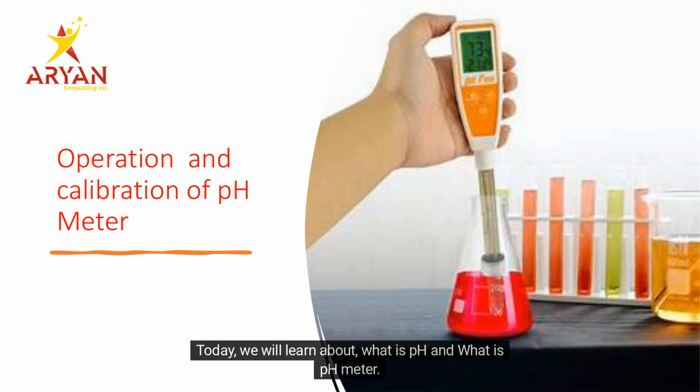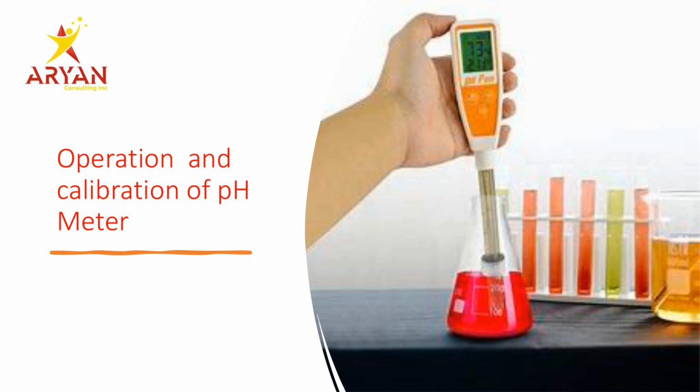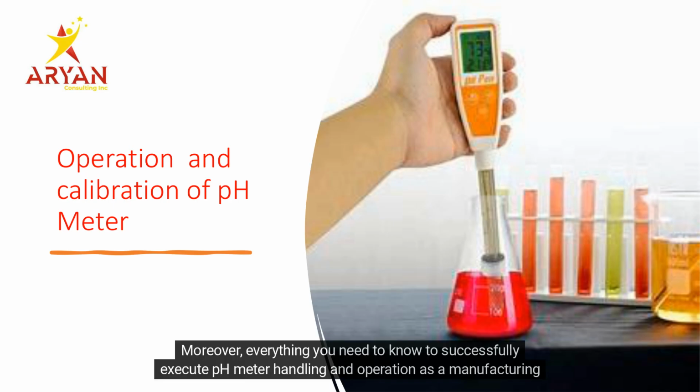Today, we will learn about what is pH and what is pH meter. We will learn about pH, its significance in general life, and requirements in pharmaceuticals. Moreover, everything you need to know to successfully execute pH meter handling and operation as a manufacturing technician.